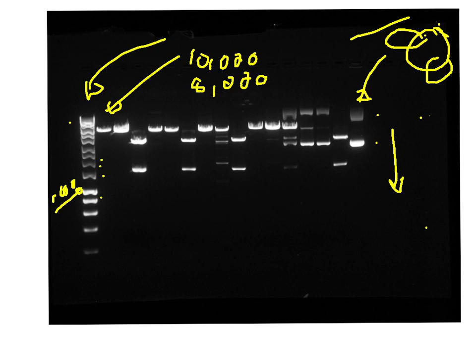So if we have a look at our samples, these three samples here, this gives us a pretty good idea of the digest that we'd expect, as do the second set of samples just here. And these are probably not too bad. This one here is a partial digest of the plasmid DNA because we can see we have some remaining supercoiled DNA here.